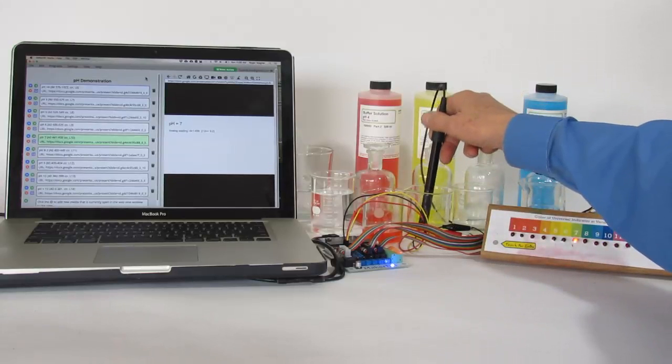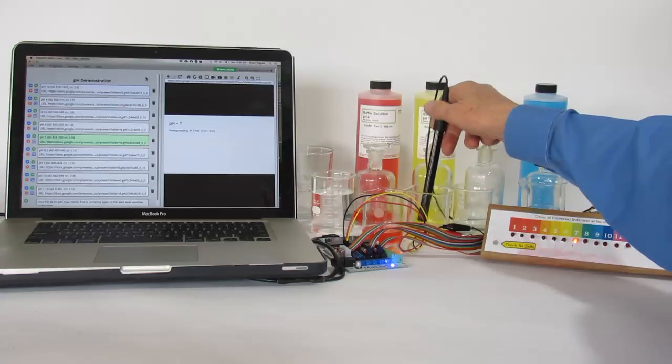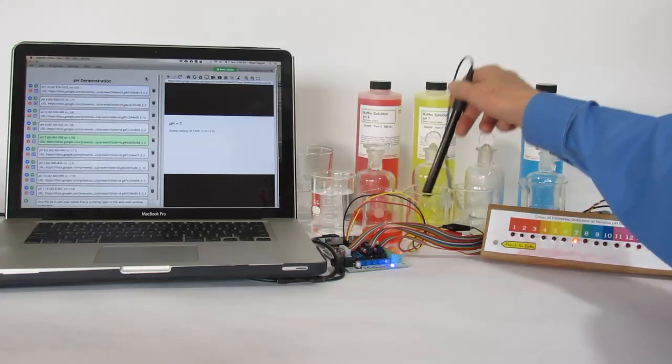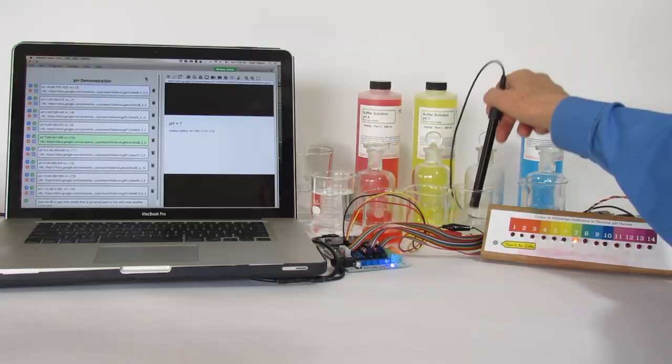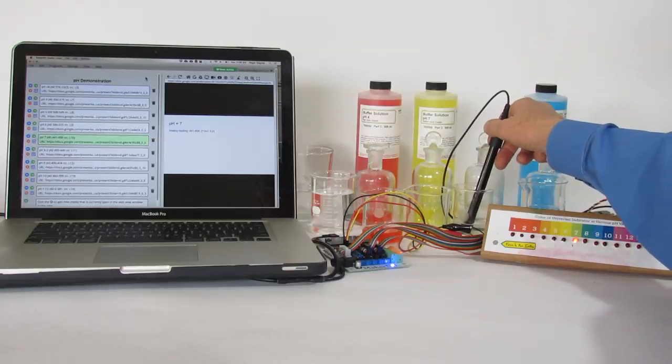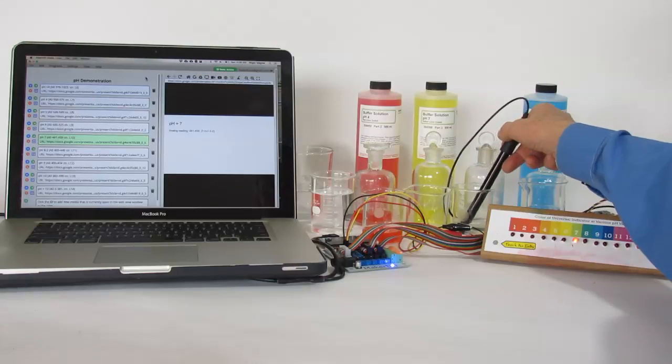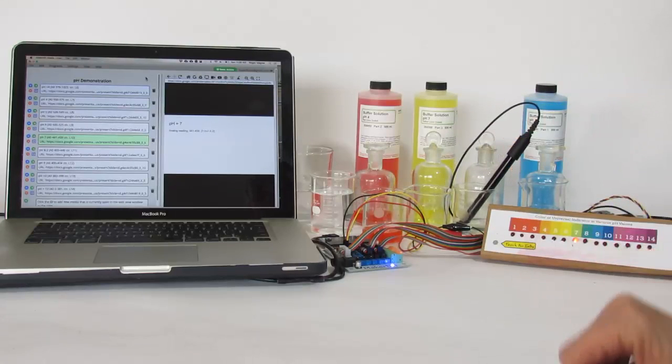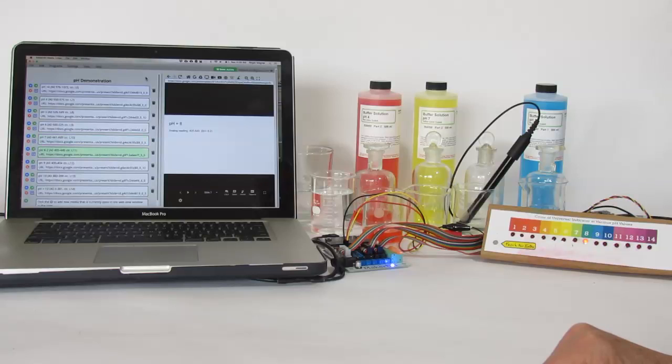We will move it now to an unknown, and the slide changes to 8.